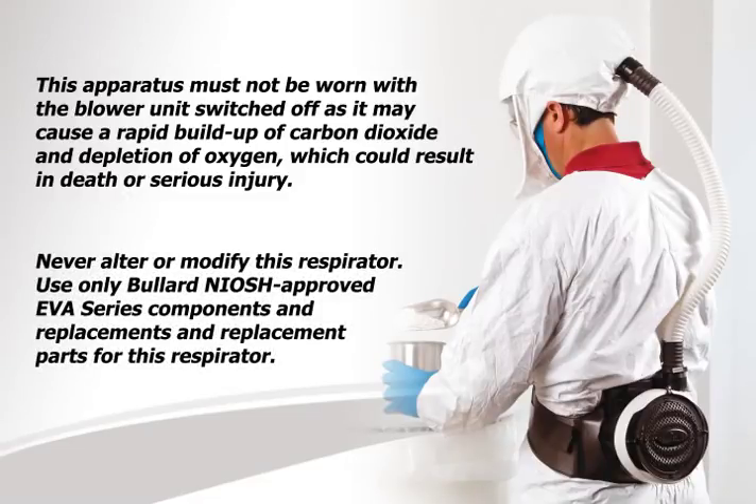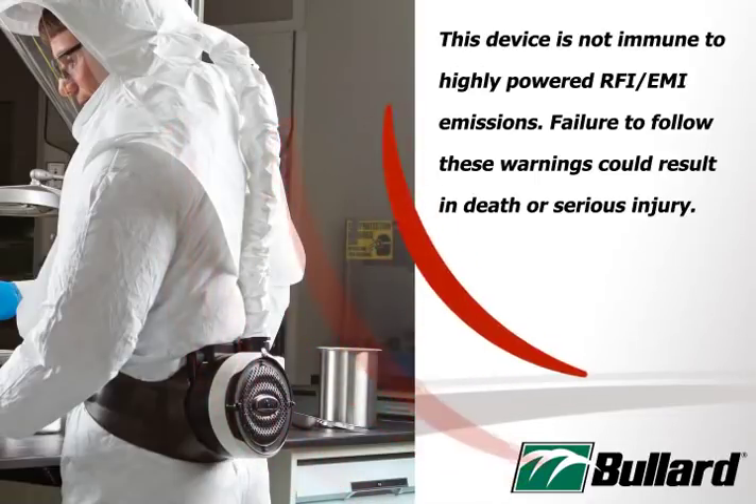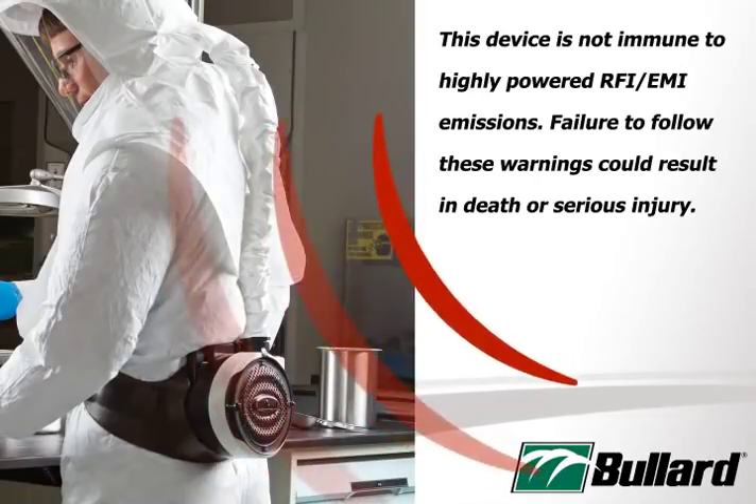Never alter or modify this respirator. Use only Bullard NIOSH approved EVA series components and replacement parts for this respirator. This device is not immune to high powered RFI or EMI emissions. Failure to follow these warnings could result in death or serious injury.